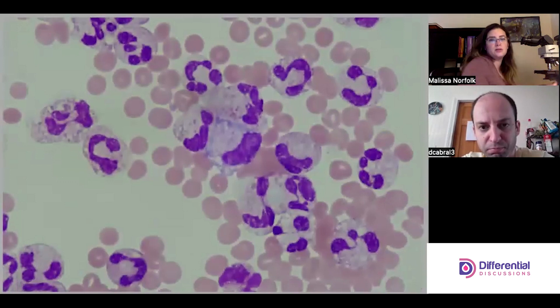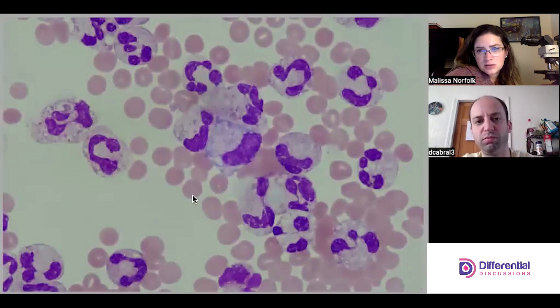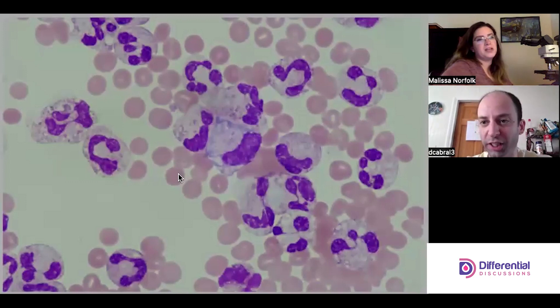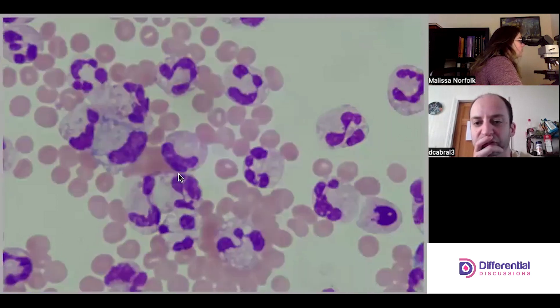There's another monocyte in the center — beautiful mono. I was trying to see if there are crystals here; those are the ones that can give you heartburn when you don't know whether to call them or not. Lucky for us we've had huge signals elsewhere. But I think there are some tiny pseudogout crystals in that cell.